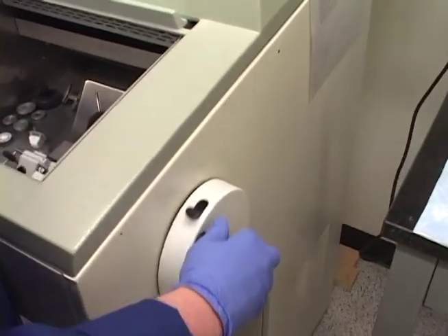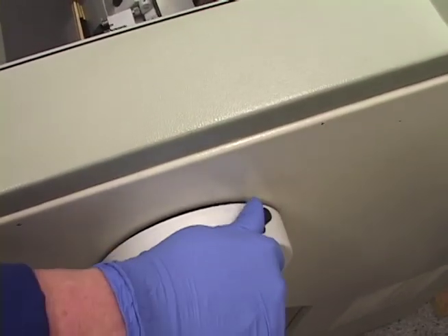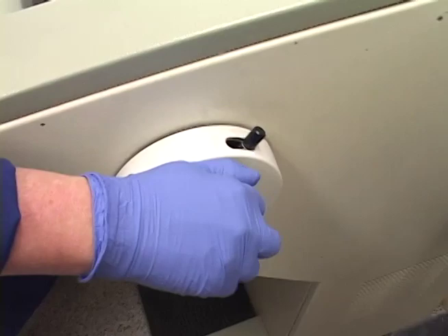This is our safety lock. When you're changing the blade, changing the specimen, or making adjustments, you want to lock it. How you lock it is you push the flywheel forward and it locks.